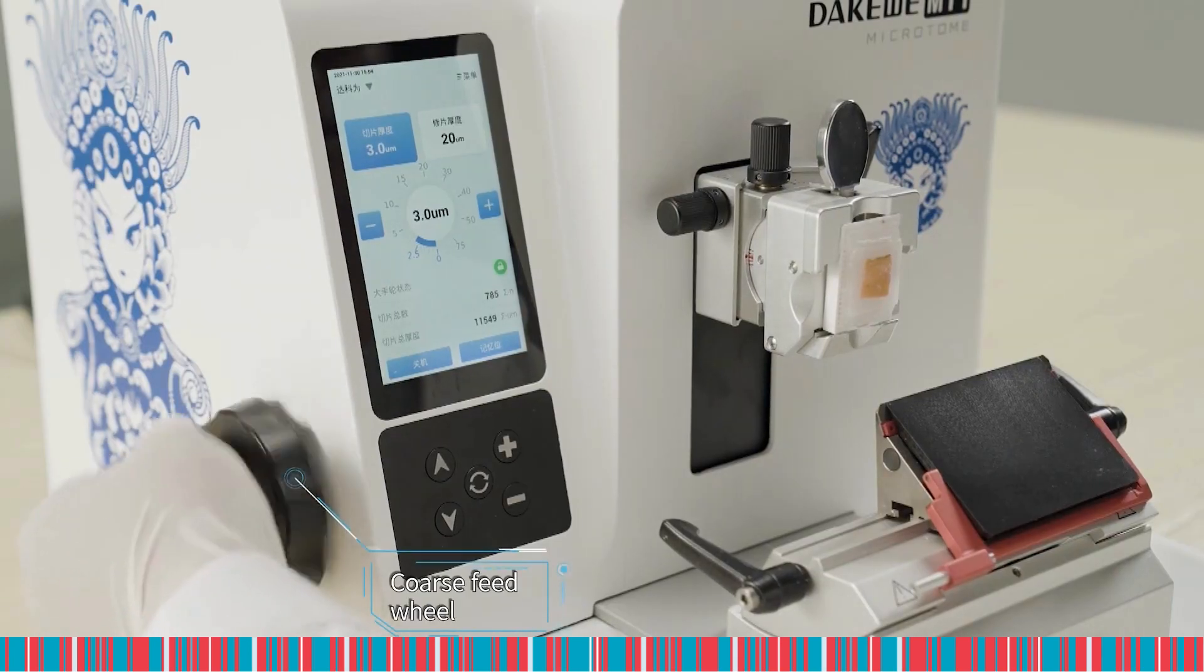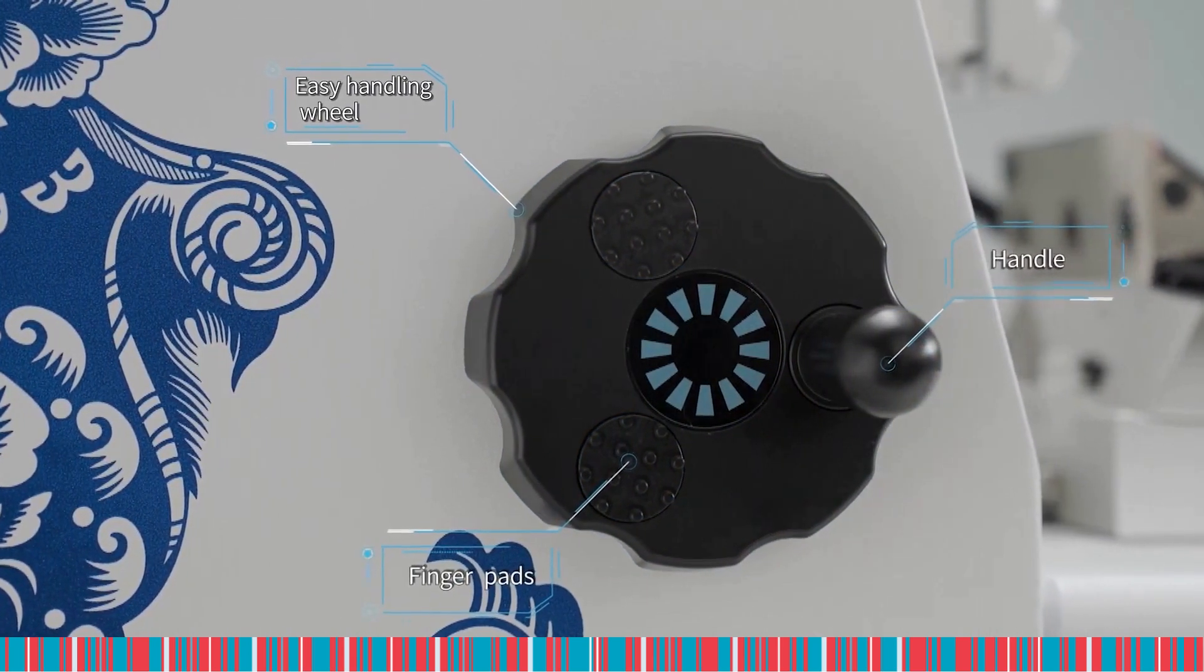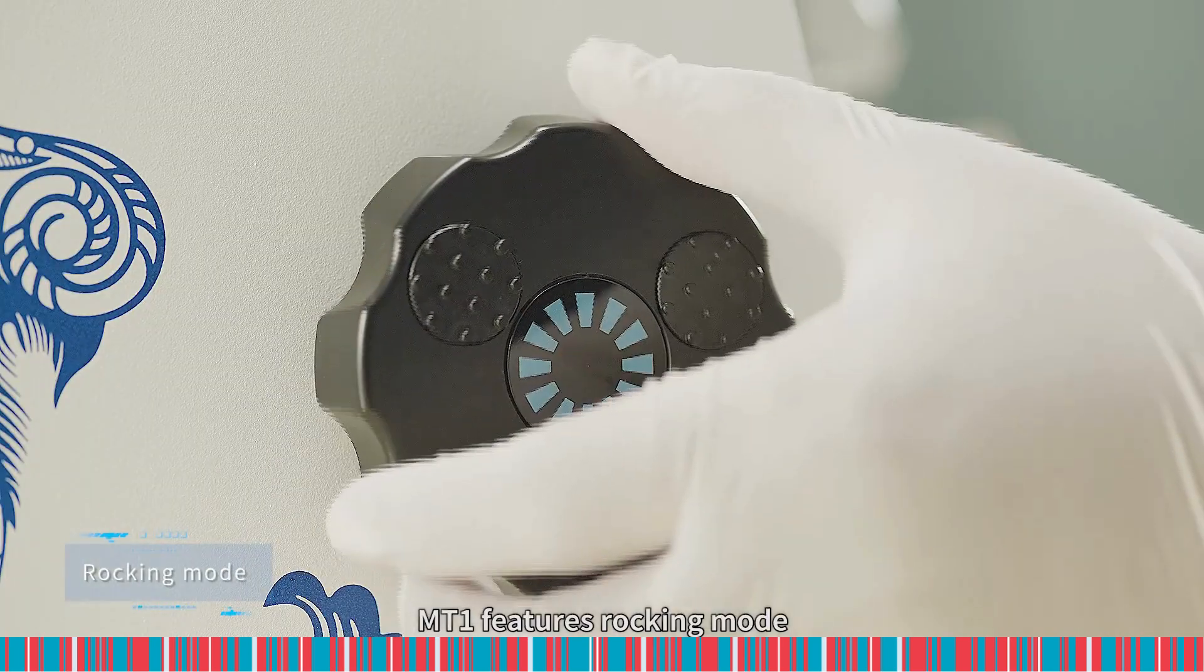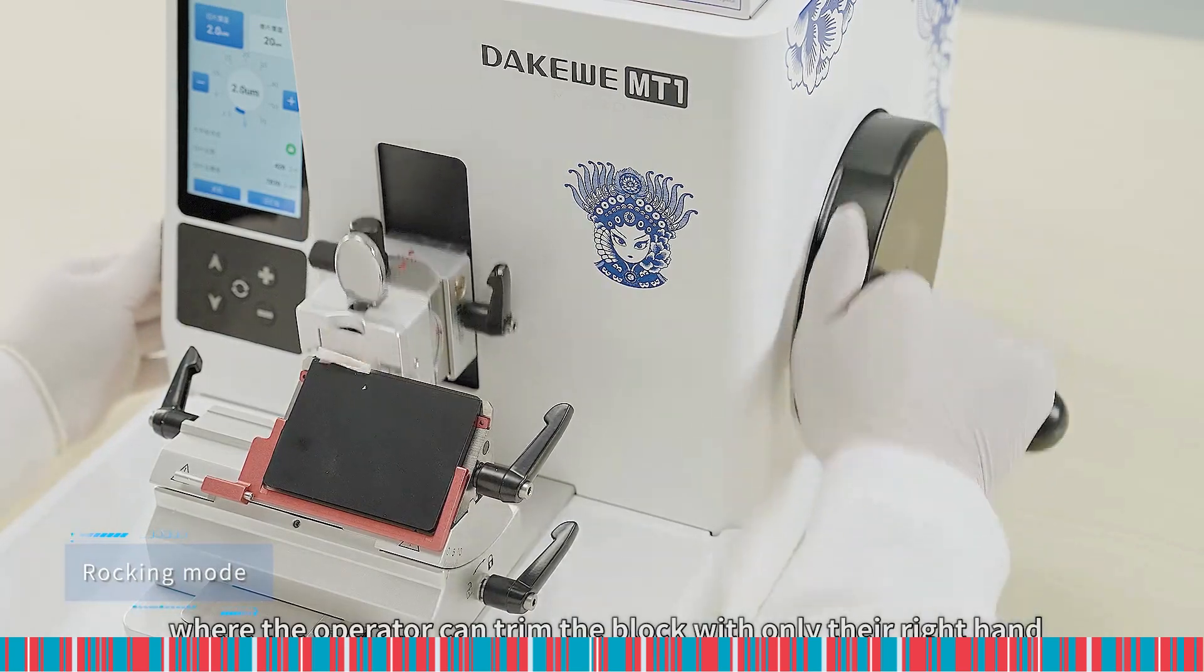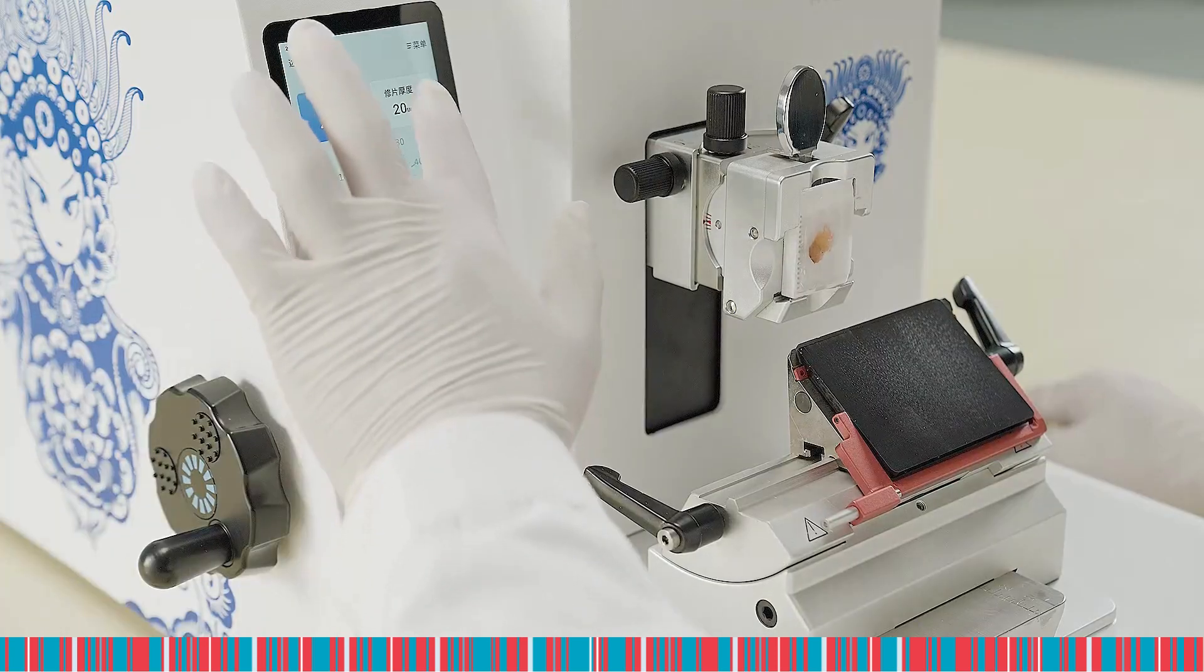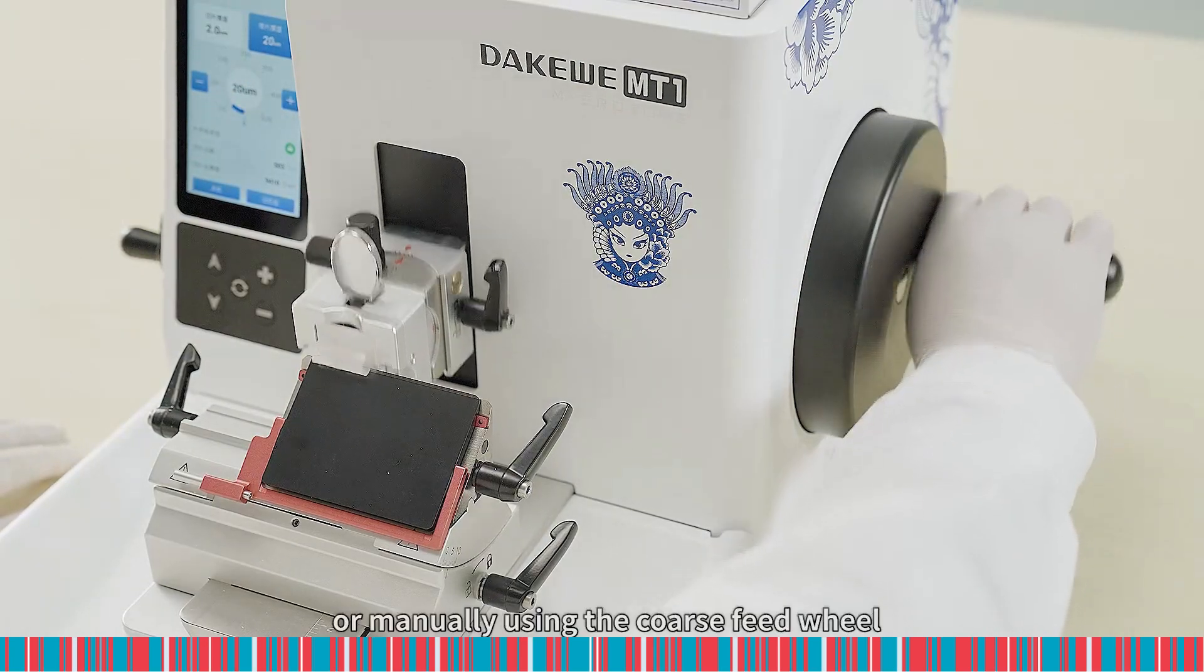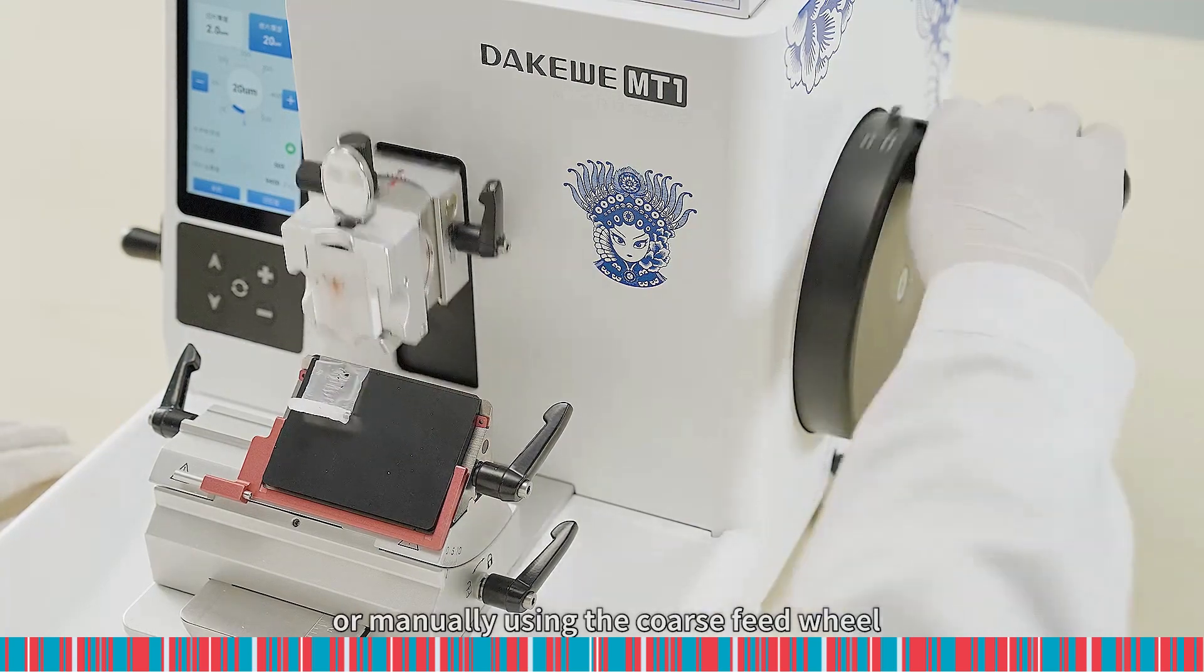3-in-1 coarse feed wheel fits user preference. MT1 features rocking mode where the operator can trim the block with only their right hand. Trimming can be done semi-automatically or manually using the coarse feed wheel.